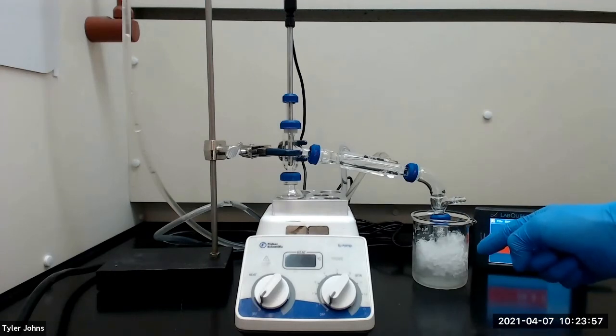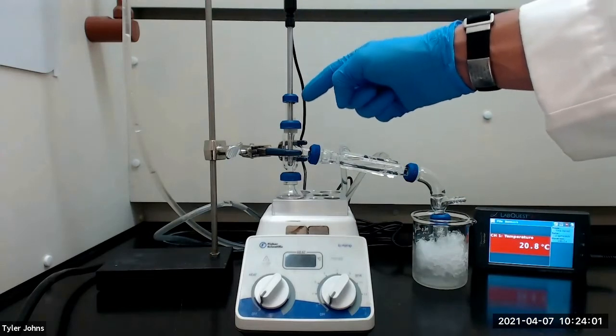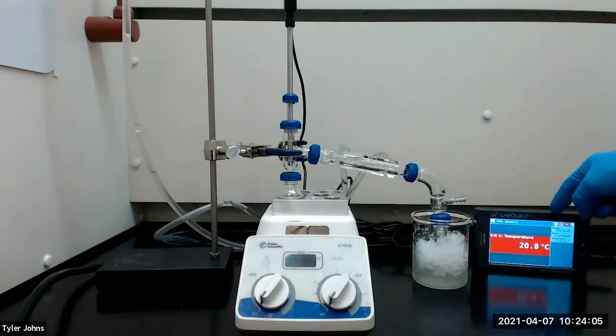I have immersed the pre-weighed conical vial in ice to ensure condensation. I've also connected a Vernier temperature probe inserted through a thermometer adapter to monitor the temperature throughout the distillation. We will continue the distillation until only one or two drops of liquid remain in the distilling flask.